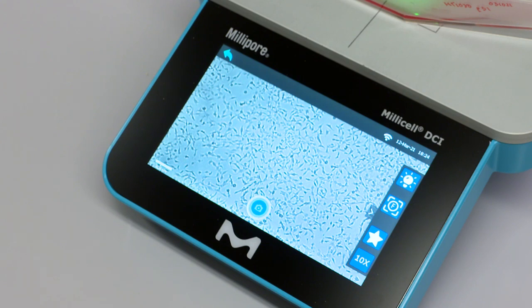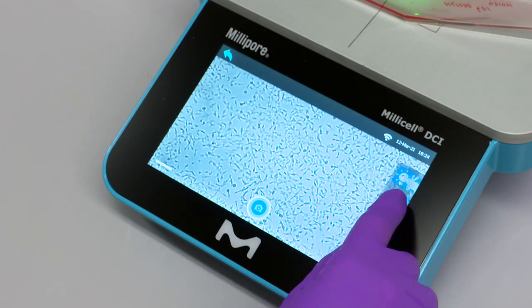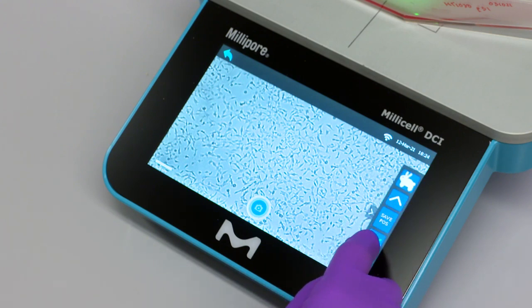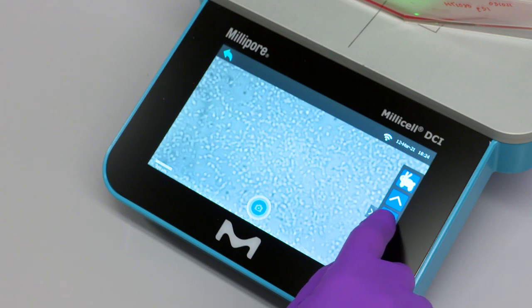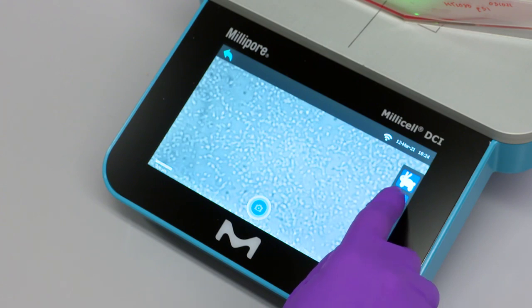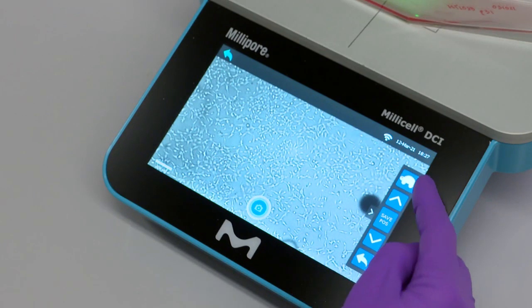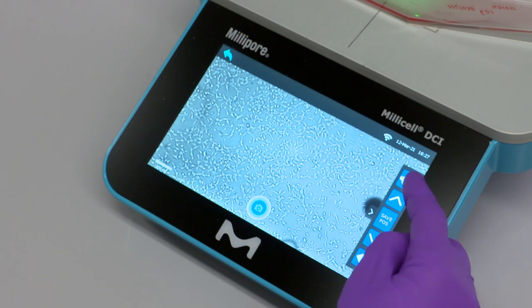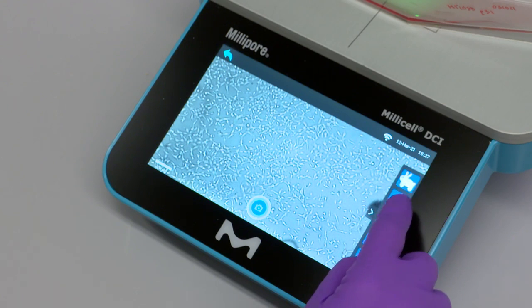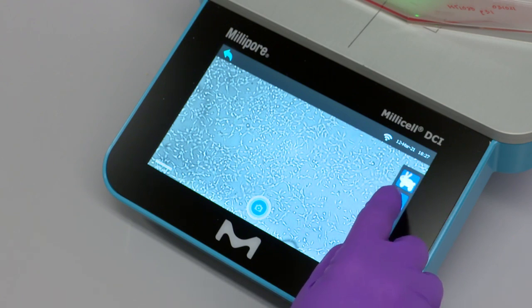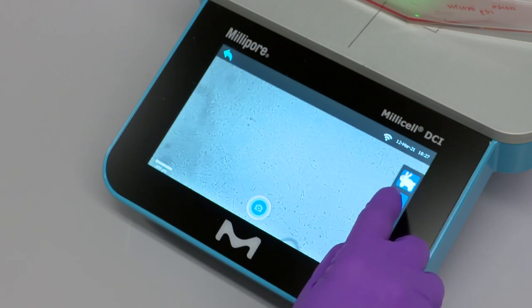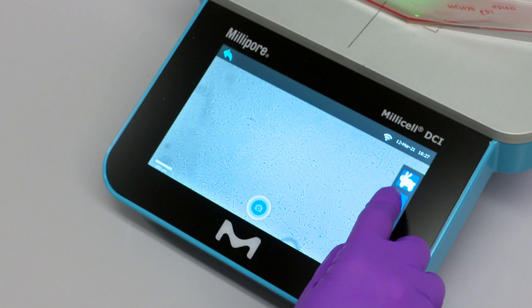The focus can be adjusted by clicking on the F icon and using the adjustment arrows. Focus is available as fine, marked as a turtle icon, or coarse, indicated by the rabbit icon. To switch between fine and coarse focus, simply click on the icon.